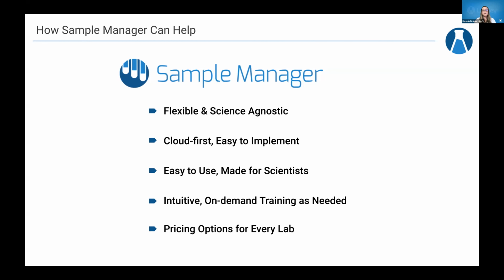It also is really meant to grow with your lab, as the slide a couple slides ago had demonstrated, helping you manage more complex LIMS processes or manage clinical trial data as you need it and as your group needs it, as well as capturing those large molecule biologics entities with our other product, LabKey Biologics.